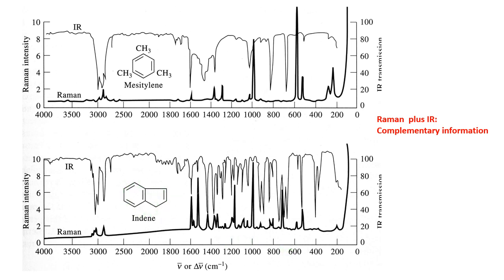The problem with infrared and Raman is relatively low sensitivity. So when you have isolated enough of your compound and separated it from others, yes, you can do this identification. But if you have literally traces of your compound diluted in some solvent, in many cases, these methods are useless.